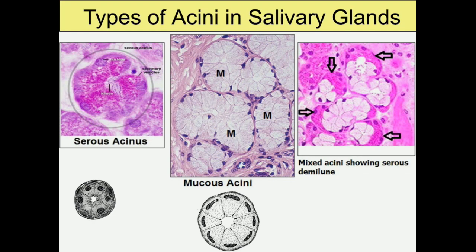Now, here we have, as regards the cells of the serous, in addition to the position of the nucleus, actually here in the picture, it is not completely central. No problem, we will look for also another more evident feature, which is the presence of the secretory granules, acidophilic, at the apex of the cell. Here we don't have any granules but evacuated cytoplasm due to dissolving of the mucus during preparation of the section. So here it is rounded, this is flattened. According to theoretical, it should be central, but never mind.